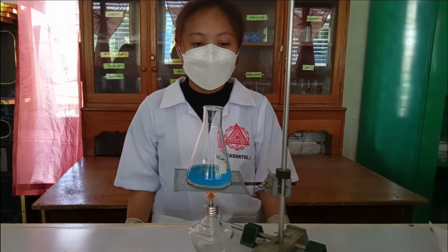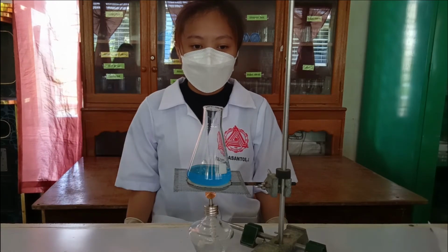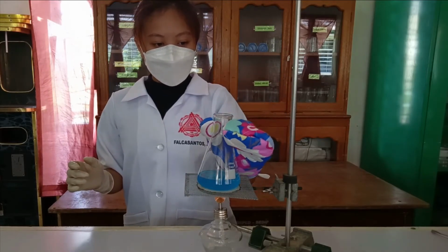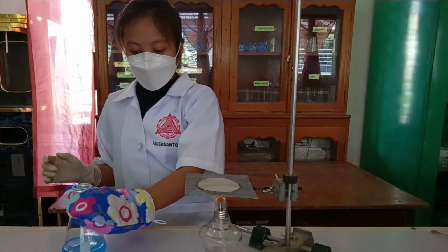If the flask is more than 1/4 full, you can also put it on a wire gauze and a tripod. Put boiling chips or a glass stirring rod to avoid the problem of bumping. Remember to always use a rag or heat-resistant gloves when touching the flask to protect yourself from being burned.